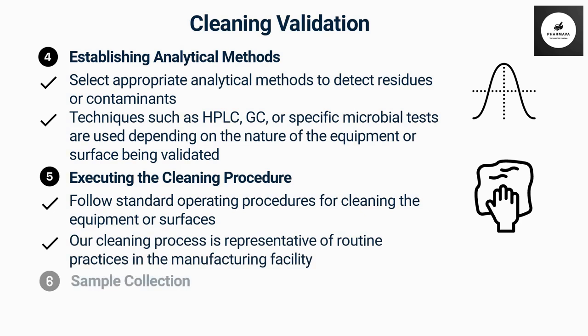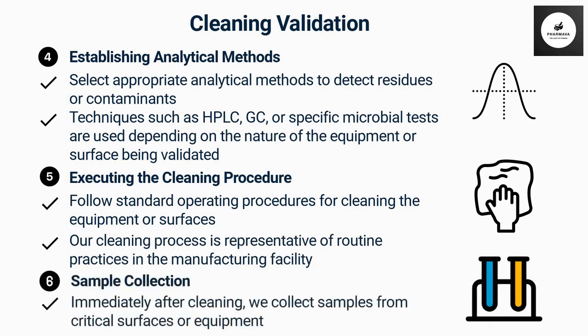Step 6. Sample collection. Immediately after cleaning, we collect samples from critical surfaces or equipment. Swabbing, rinsing, or direct surface sampling techniques are used to gather samples for further analysis.